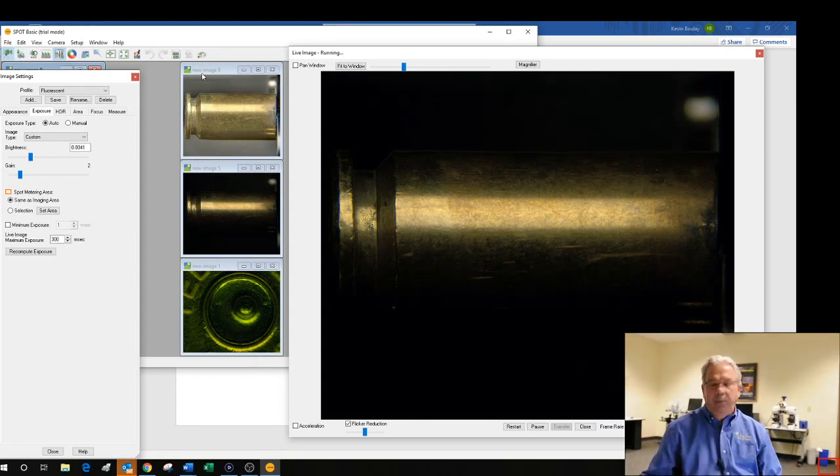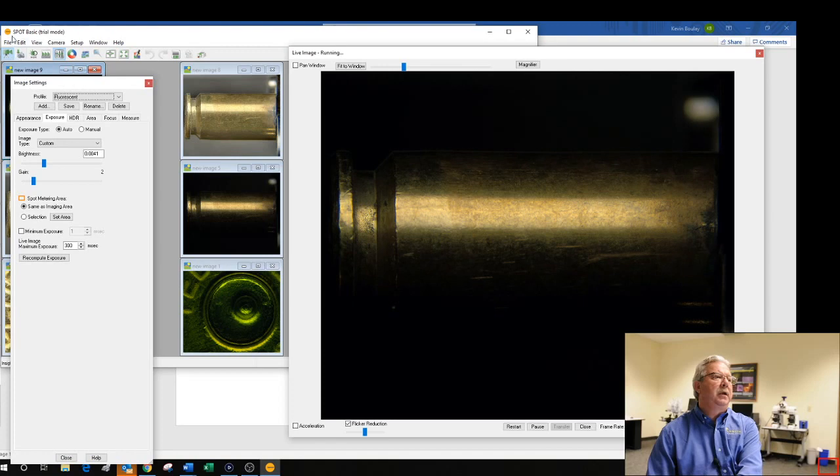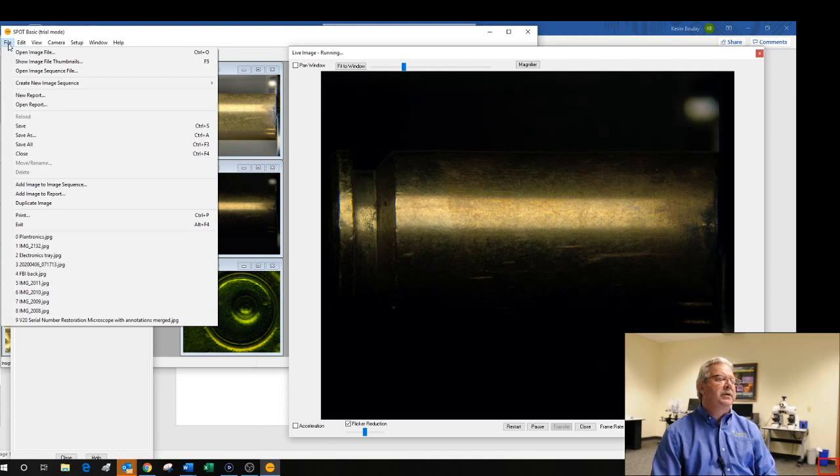I don't know if you are all using text and annotation. I'm going to talk about that for just a minute. So again, going back up to the written menu up here, there is something that says File. This pretty much resembles, in my mind, a Microsoft type menu.